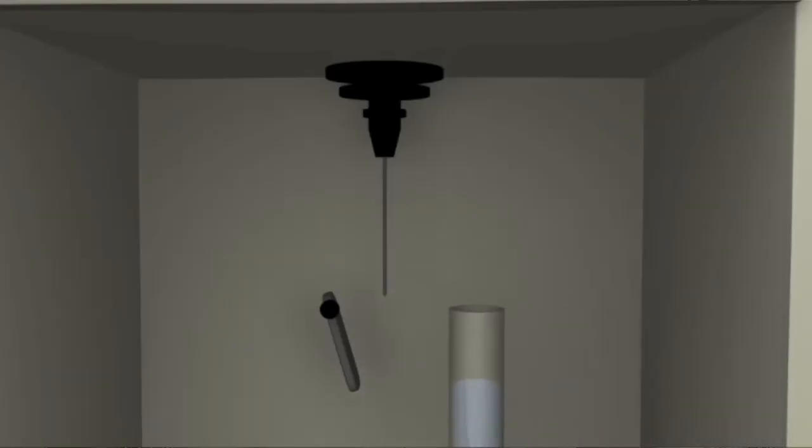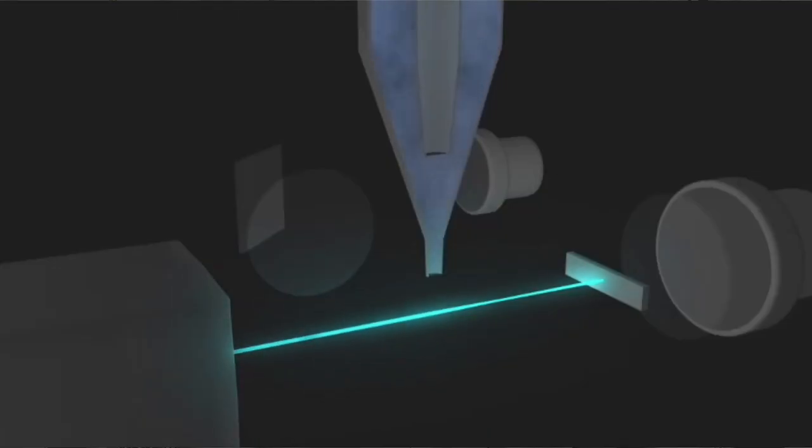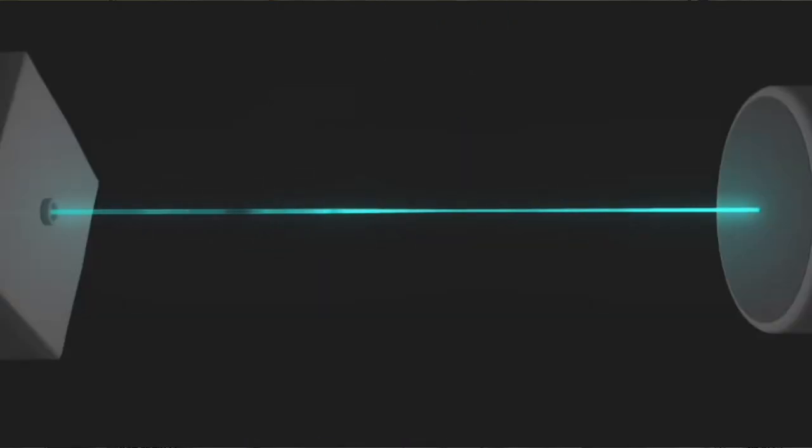After sample preparation, the next step is the fluidic system. The sample is injected into a stream of sheath fluid which focuses the cells into a narrow single file stream. And after this fluidic system, the laser and detection steps actually start.